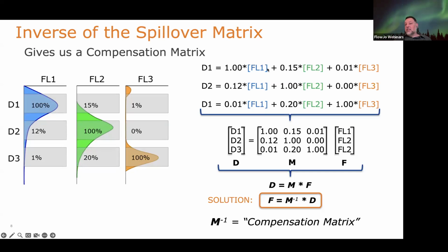So the point here is not that you need to know matrix math, but that it's not as simple as just subtracting away the spillover coefficients. You're actually inverting a matrix and creating this compensation matrix, which is the inverse of the spillover matrix itself.